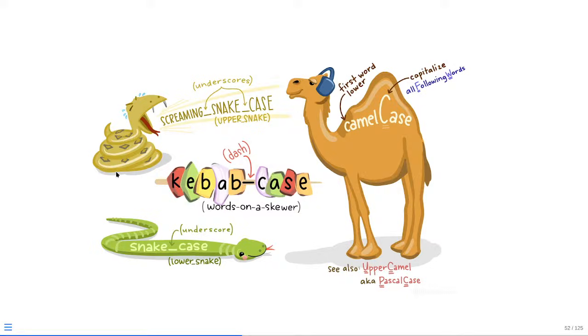Different bioinformaticians and different software developers will have preferences as far as how they go about naming the particular objects or variable names. Some, if they're using multiple words, will separate them with that underscore, which is what we know as snake case. Some of them will use a capital for the start of every other word. In this case, you'll see it looks kind of like the hump of a camel when you're looking at its appearance.